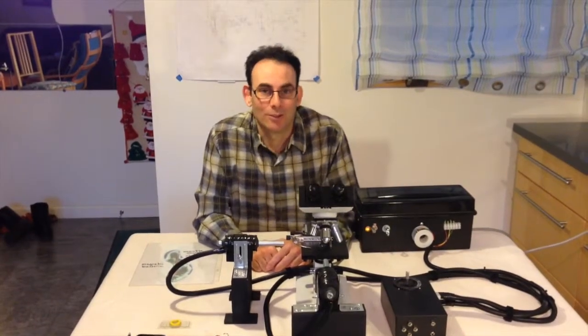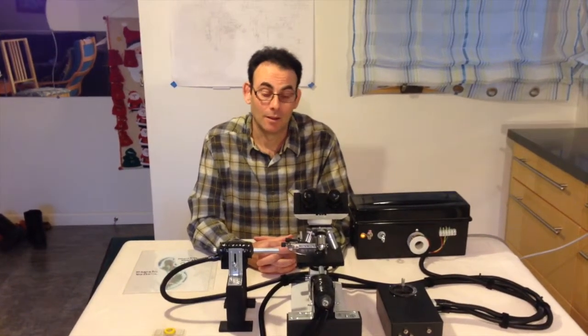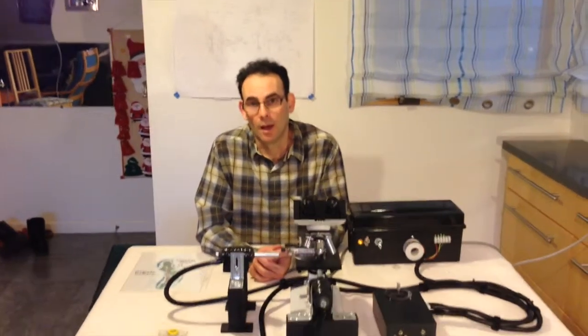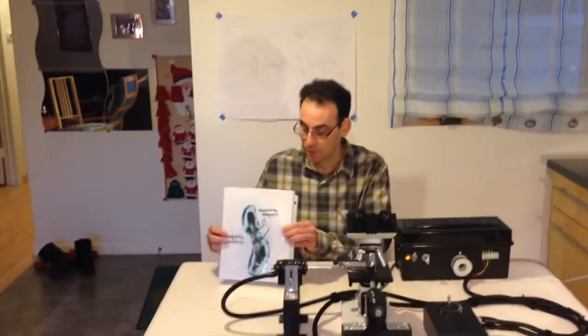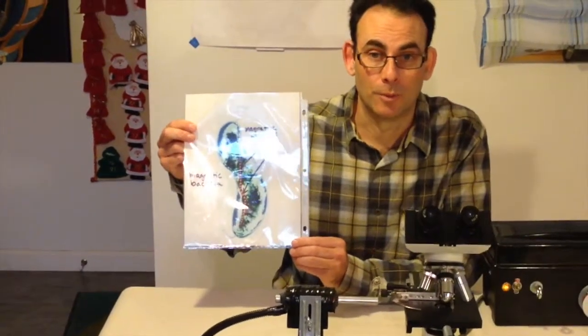We're going to explain some hardware we made to manipulate magnetotactic bacteria in two dimensions. You can see the hardware here for this experiment, but first I want to talk about the magnetic bacteria themselves and how we exploit their properties.